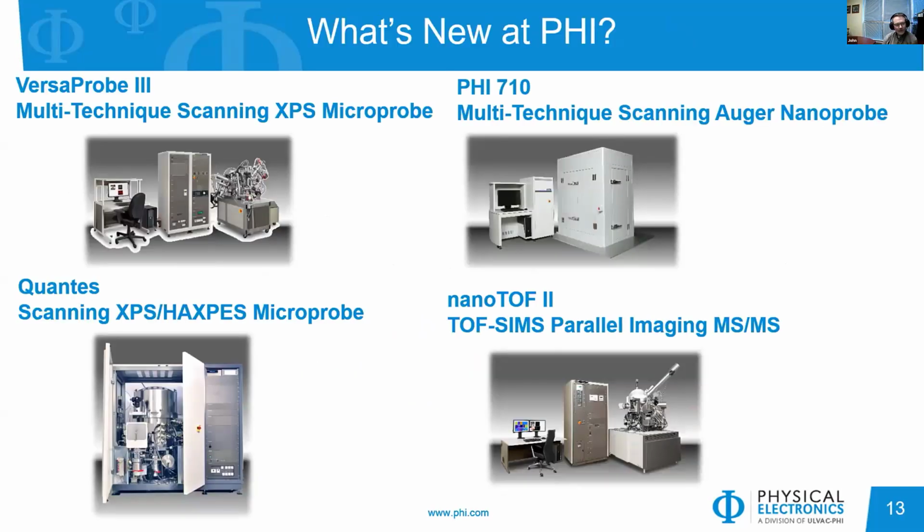So we have several different systems, of course. I'll be mentioning 4 different ones that have some recent updates in them: the VersaProbe 3, the PHI 710 Auger, the Quantes system, and the TOF-2.